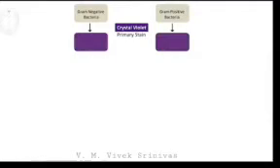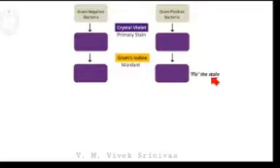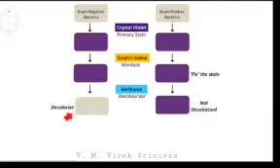Next we stain with Gram iodine, and it retains their violet color. Don't forget, Gram iodine is called the mordant. Next we stain with methanol, the decolorizer, and only the Gram-negative bacteria will decolorize, while the Gram-positive bacteria retain the violet color.